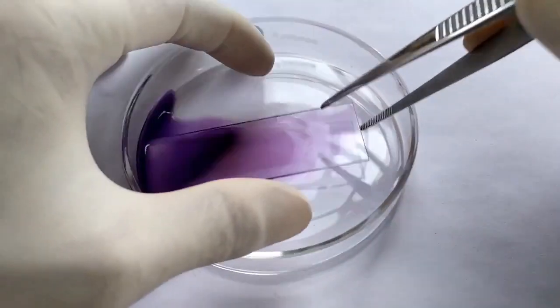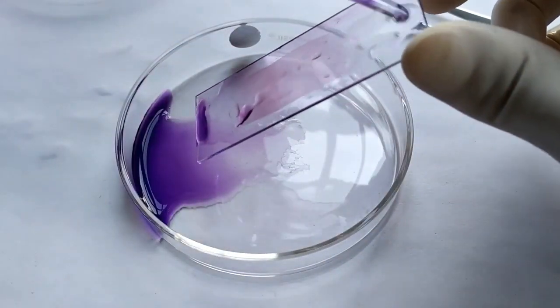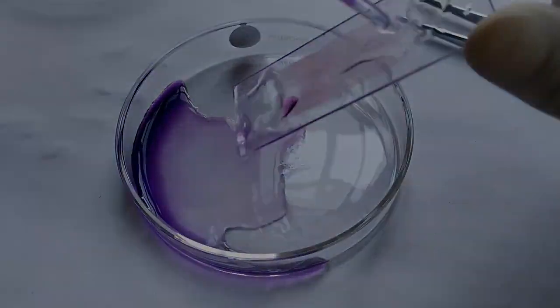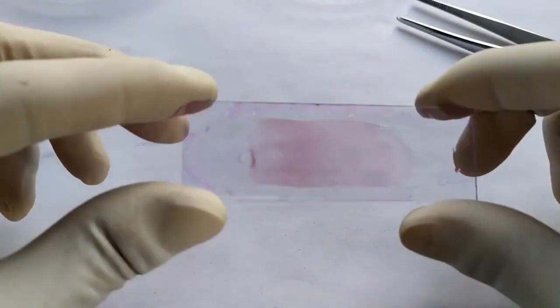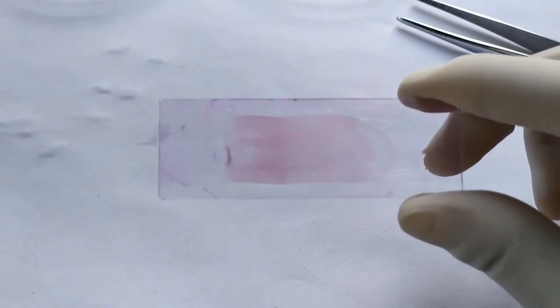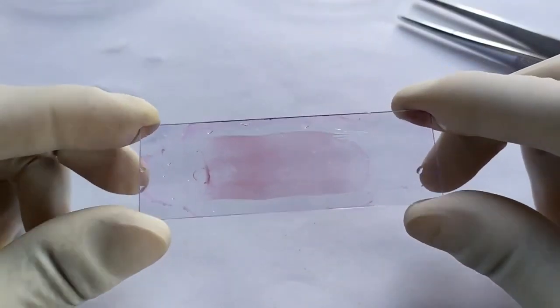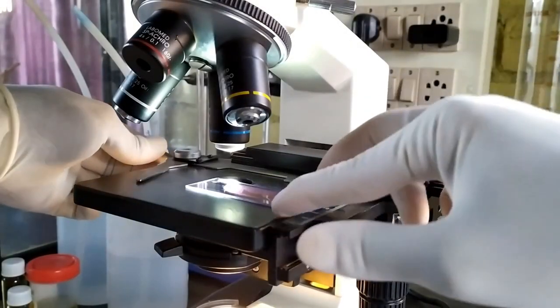Drain the slide and wash with distilled water. Proper staining results in a blood smear that is rose pink in color. Air dry the slide while keeping it in an inclined position. The slide is now ready for observation under the microscope.